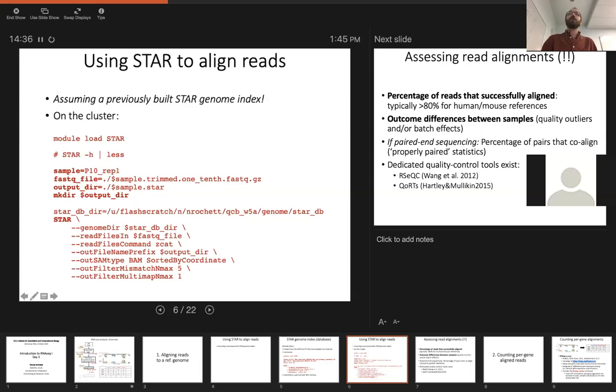And then the out filter is going to change which reads are considered aligned. In this case, it's reads with a maximum number of 5 mismatches. Okay, and there are a few parameters that you can play with, but in general, aligning to the human or mouse genome, especially here, it's going to be the same mouse strain that the genome is made for. So it's going to be very close. We don't really expect any strong deviations. So 5 mismatches out of 76 bases, which is the length of our reads, is going to be plenty.